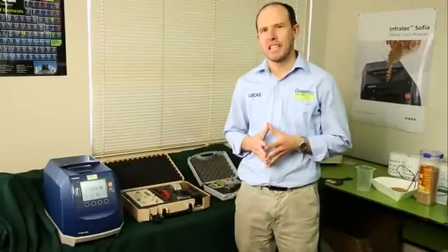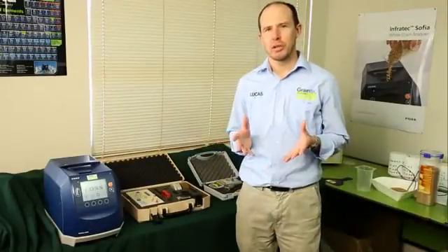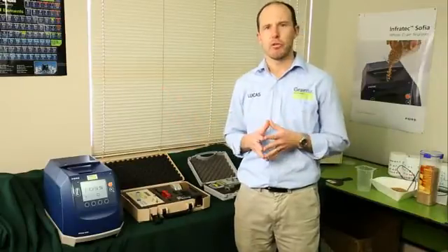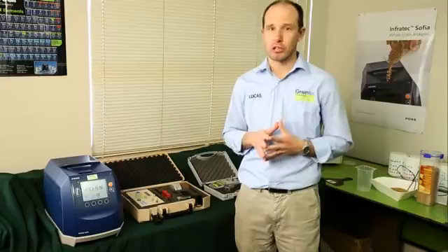One of the questions we often get asked is, why doesn't my moisture meter read the same as the depot? There are a few reasons, and I'd like to talk to you about them.